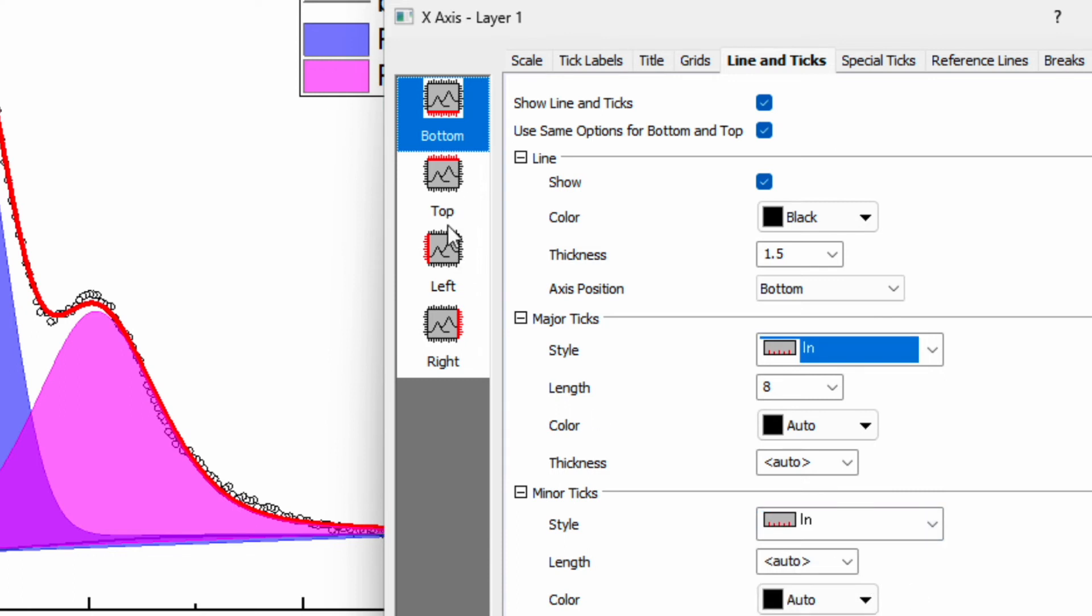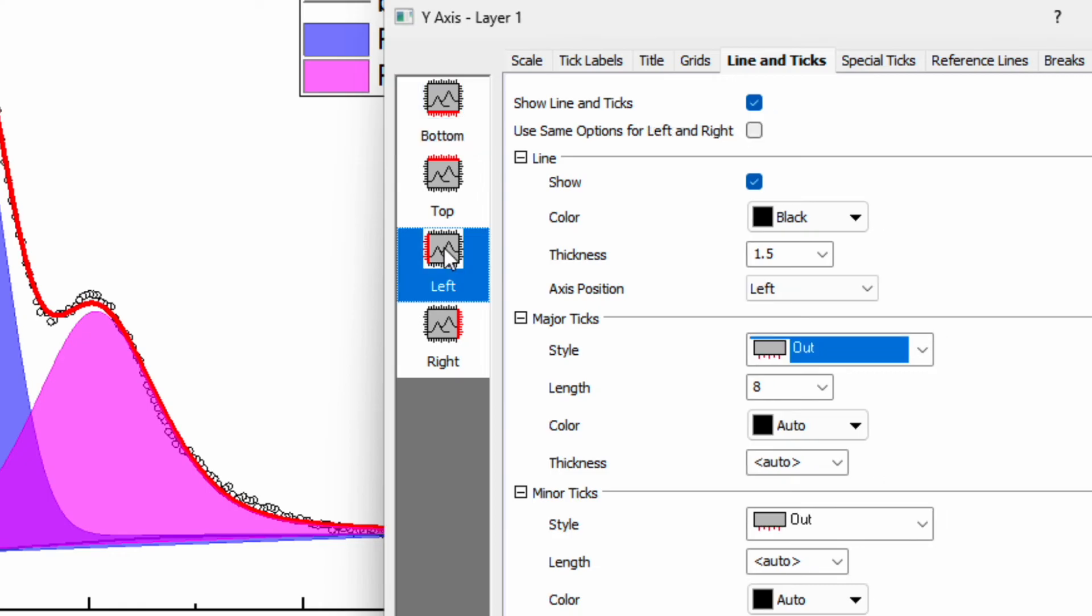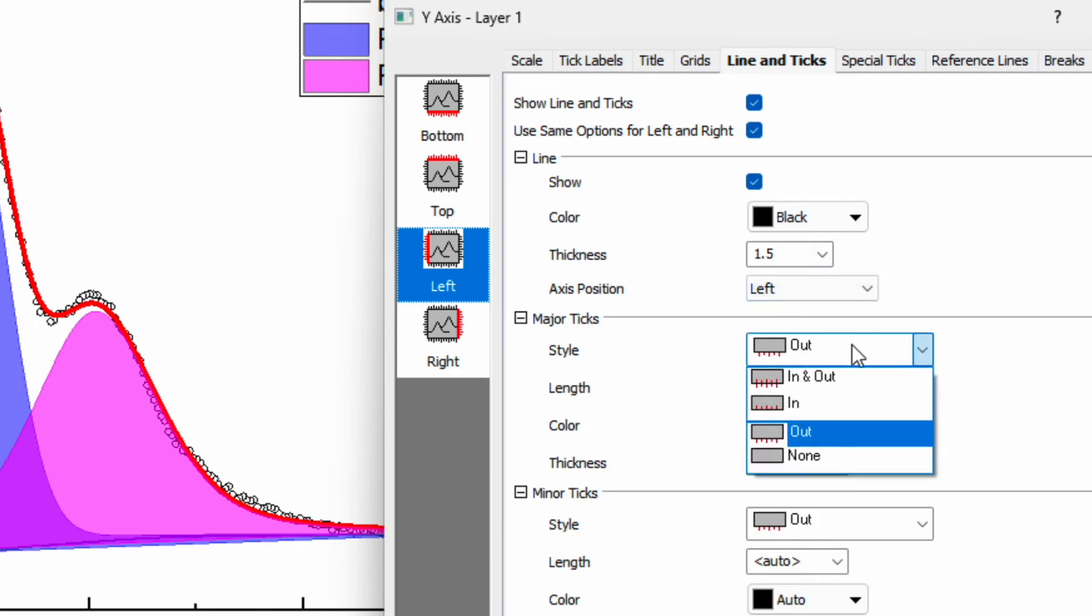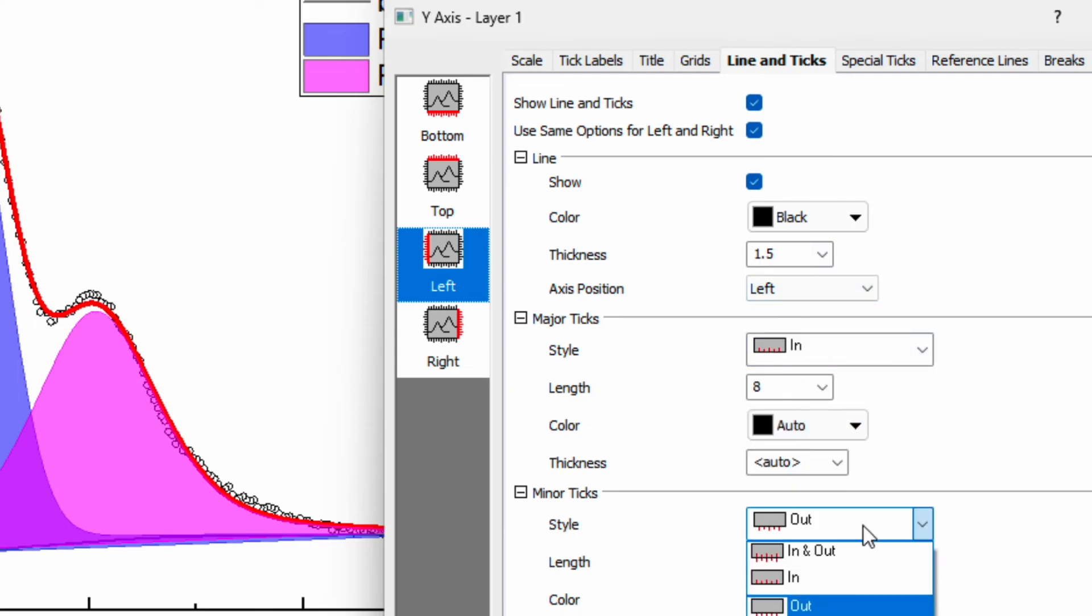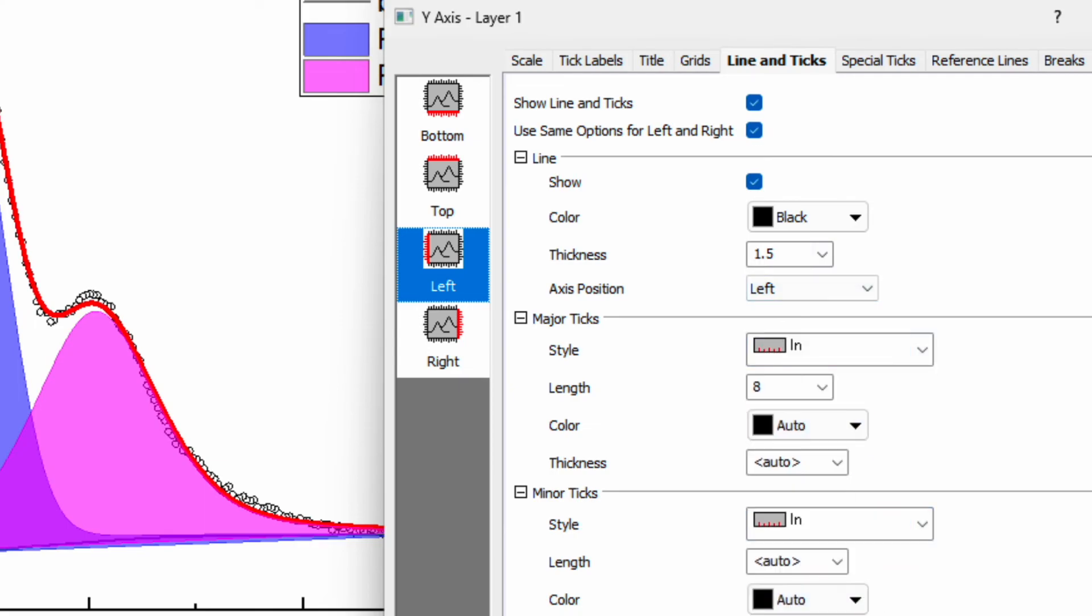Similarly, go and click on the left, and here check this box again. Change this one to in and this to in, and apply.